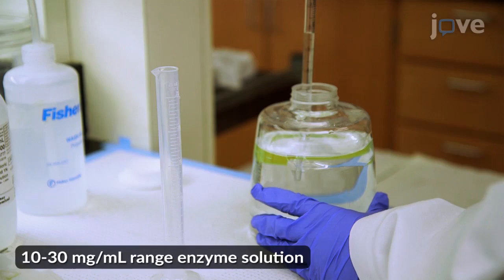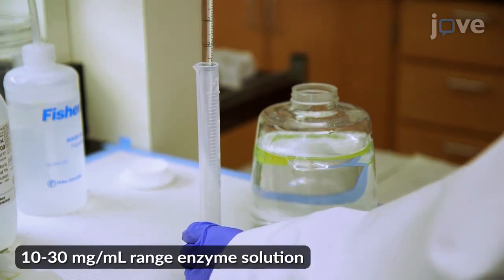To prepare the enzyme solution, in a 15 milliliter graduated cylinder, measure 8 milliliters of the 0.1 molar sodium acetate buffer. Then add the buffer solution into a 15 milliliter conical tube with enzyme.